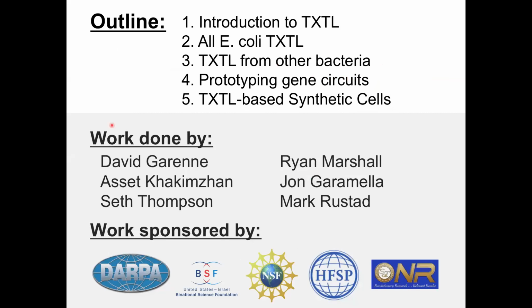Before that, I will give an introduction to cell-free expression systems and what's different with the E. coli cell-free system that my lab has developed. Here is the quick outline. I give an introduction on TXTL, the E. coli TXTL, TXTL from other bacteria, something new that I have done with Wang at Columbia. I will pass very quickly on prototyping, taking two examples very far: a very simple regulatory element, CRISPR, and very large gene sets with phages. And finally, I will focus in the last part of the talk on synthetic cells.